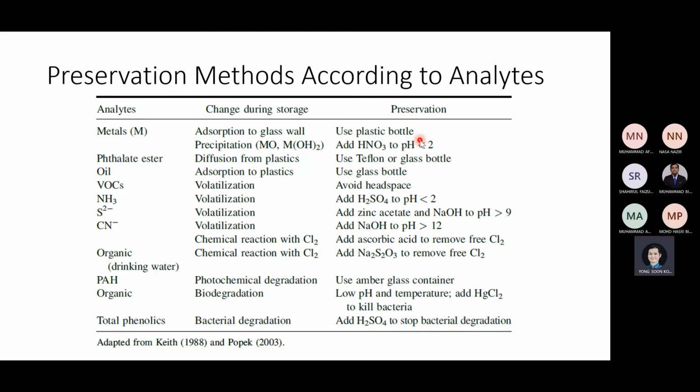But there's a thing that we need to remember: when we have metals in an acidified condition, acidified metal solutions don't interact with plastic, because plastic comes from organic oil-based material, so they don't interact that much. So in terms of interactions and cross-contamination, they are said to be quite low.